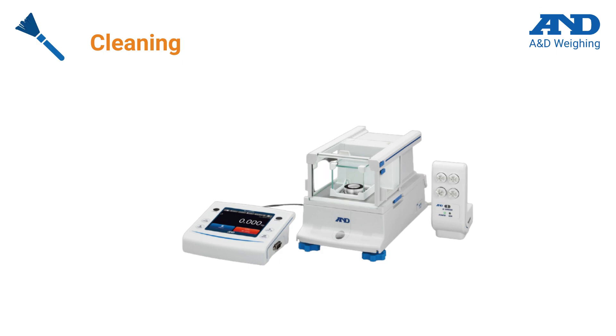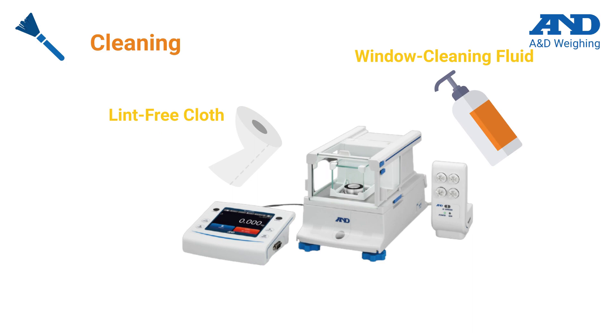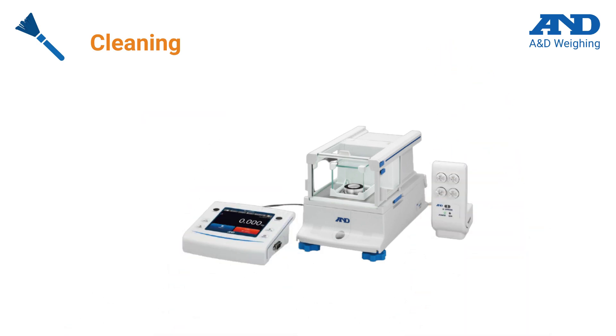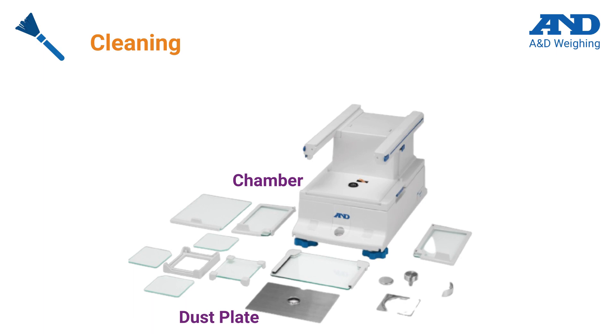The weighing chamber and weighing pan should be kept clean and clear of debris at all times. Cleaning can be performed using a conventional window cleaning fluid and a lint-free cloth. A&D scales and balances are designed to be easy to clean, with simple access to all parts of the weighing chamber, dust plate, and pan, and by using high-quality materials such as glass and stainless steel that resist corrosion and wear.